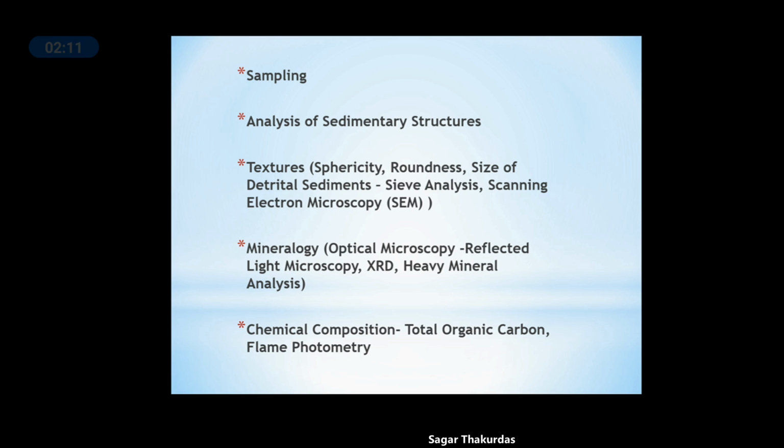X-ray diffraction is a little bit advanced than optical studies. XRD is much more useful in rocks like shale, which are very fine grained and where you cannot identify the minerals under the microscope. It is difficult to identify clay minerals, different types of clay minerals under normal reflected light microscope because of finer grain size. So in that case we can go for XRD analysis.